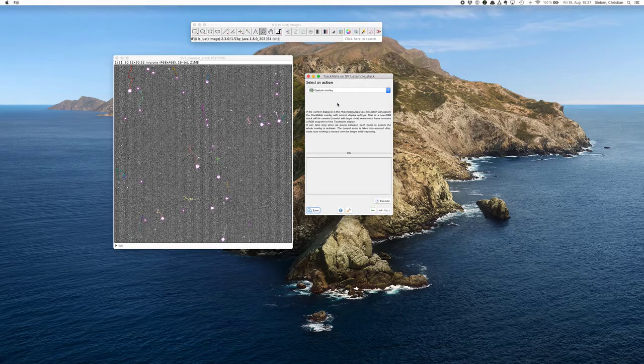And as a last step, of course, I skipped over many different options and parameters that are available in TrackMate. But I just want to jump directly from the particles now to the export option, so we can capture that overlay, which is this video of the labeled particles and trajectories, which is nice maybe for a presentation or so.